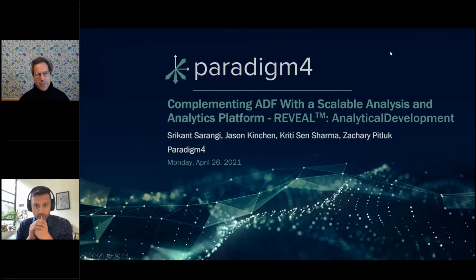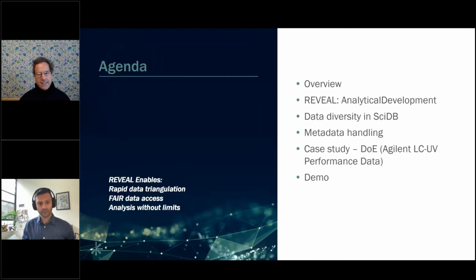So today I want to present how we can complement the ADF with a scalable analysis and analytics platform, which we've called Reveal Analytical Development. And so just a quick overview of the technology, Reveal Analytical Development, the data diversity, and how we manage the information that's in the ADF files. And then we'll get into the demo.